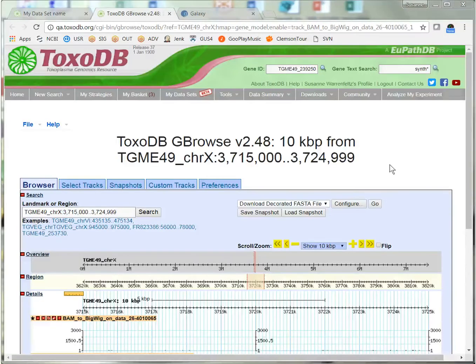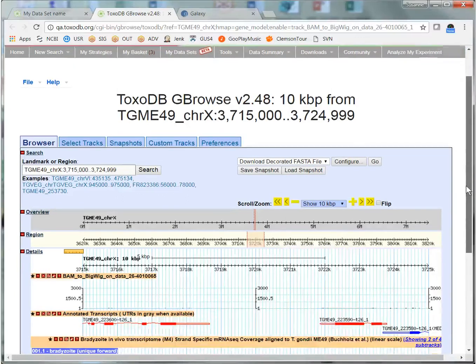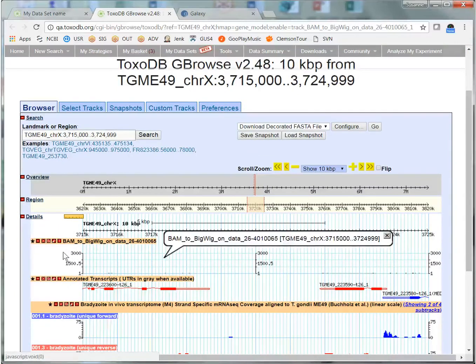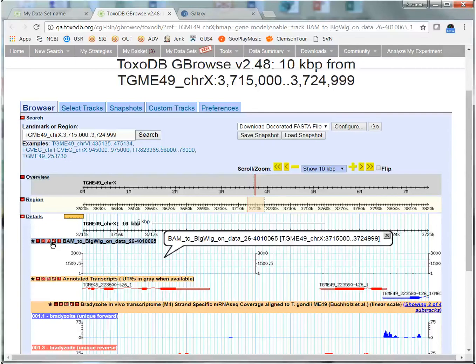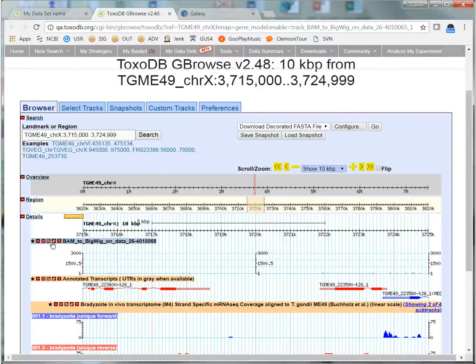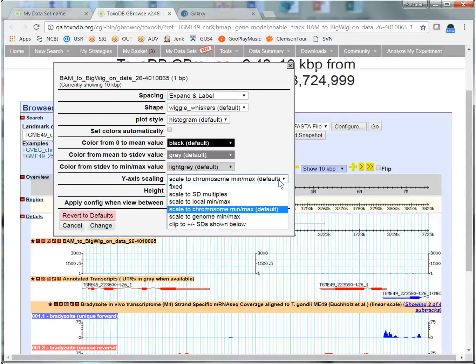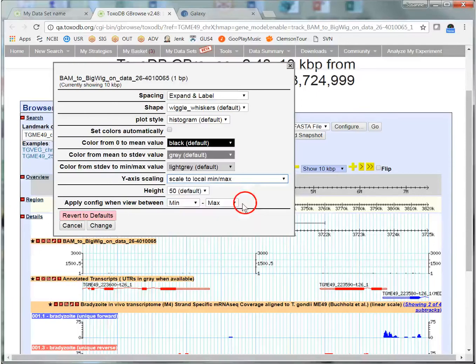And here we are at GBrowse with the file showing. Now it may not look like much now. You may have to configure some things to get everything to show up properly. And I am going to adjust the y-axis here to bring everything into view.